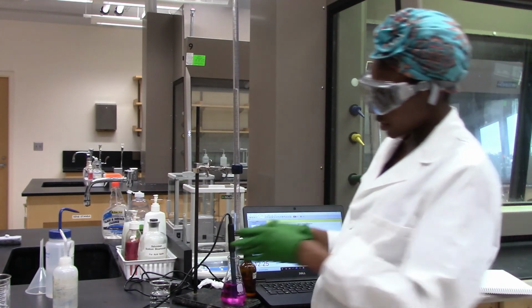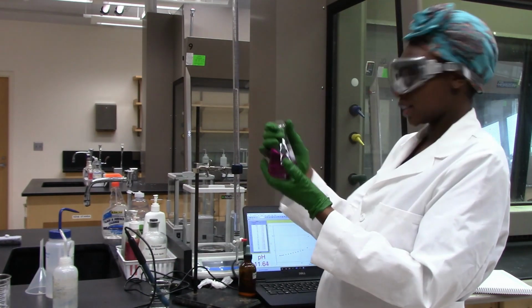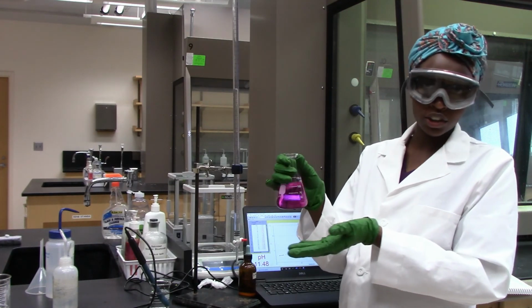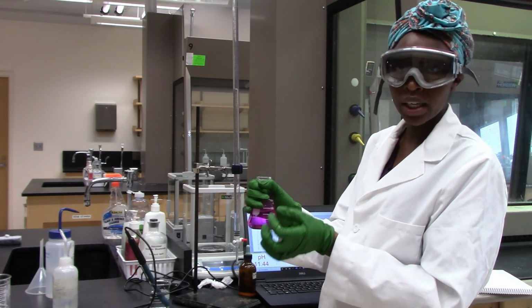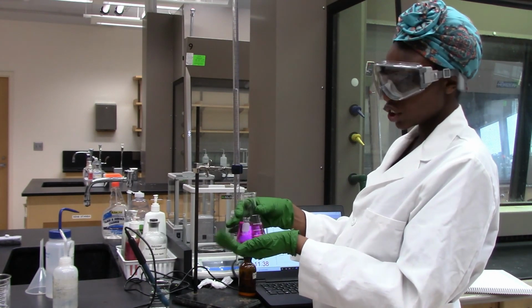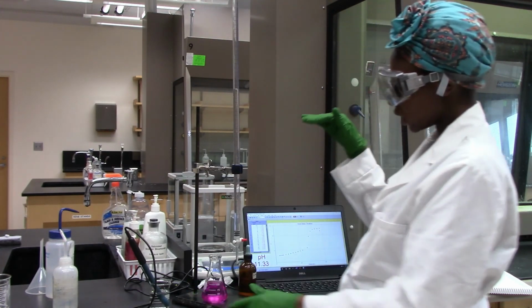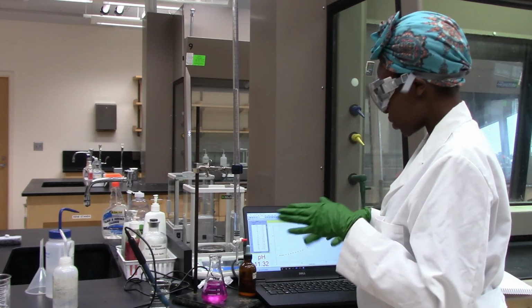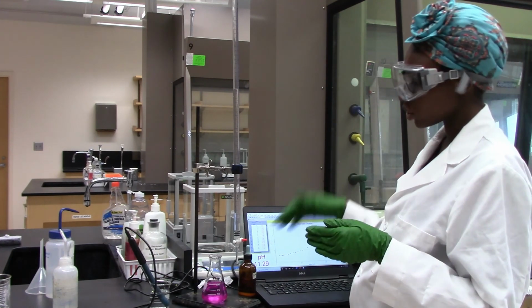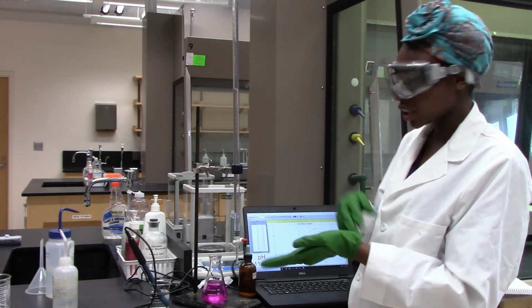Alright, so as you can see, when I started the titration, this solution was colorless, and at 14 ml of sodium hydroxide addition, we ended up with a pink color. So I just did more additions of the sodium hydroxide just to get a baseline after the pH changed from 5 to 9, and then it just kept staying in the basic solution. So at the end we have more of the sodium hydroxide in the solution. That's why the pH is really high.